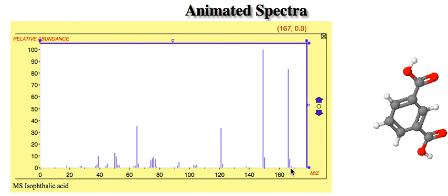Now, you can just barely on this spectrum see another peak right there. A little teeny one, even smaller than the one that's 1 mass unit higher. And that's actually that you could have 2 carbon 13s. 2 out of these 8 atoms could be carbon 13s. And of course, the odds of that are roughly 1/10 for the first one times roughly 1/10 for the second one. So you see this little teeny pipsqueaky peak over here.